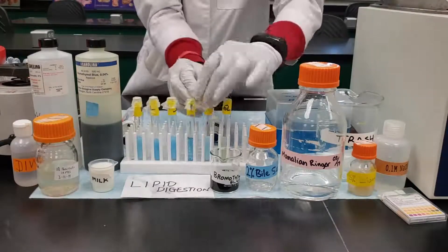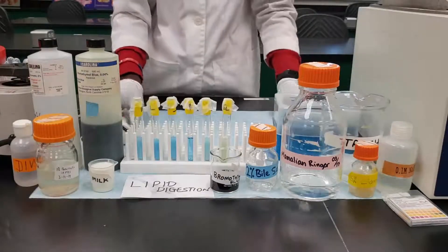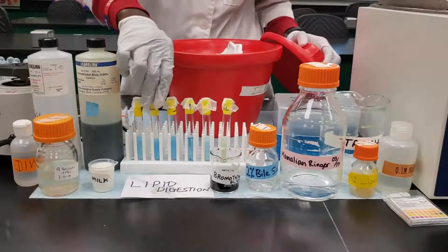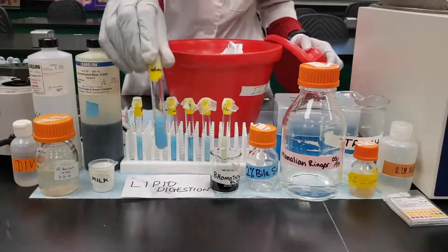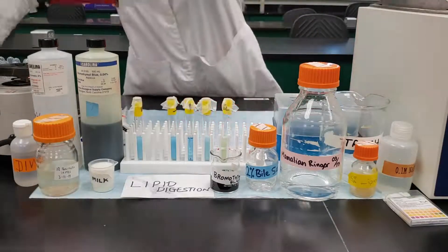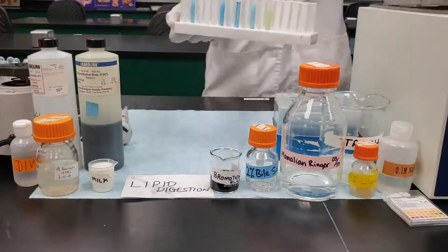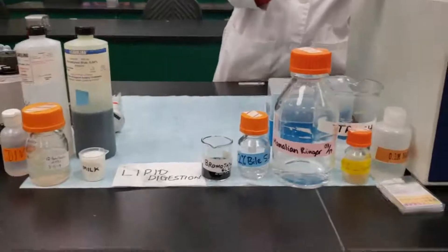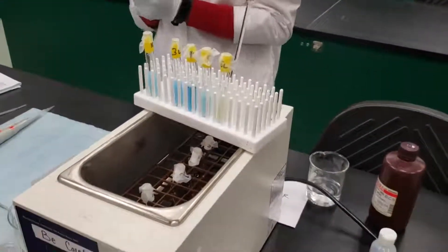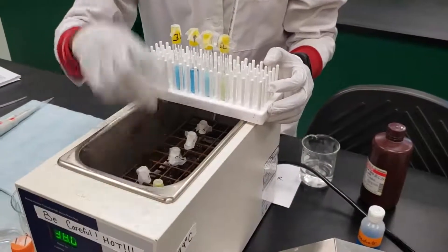After that, like we did in previous experiments, we're going to take tube 2L and put it in ice to incubate for one hour. We will then take the other tubes and put them in the 38 degree centigrade water bath to also incubate for one hour. After the incubation period we will run the lipase test, which will be shown in the PowerPoint in the course modules.